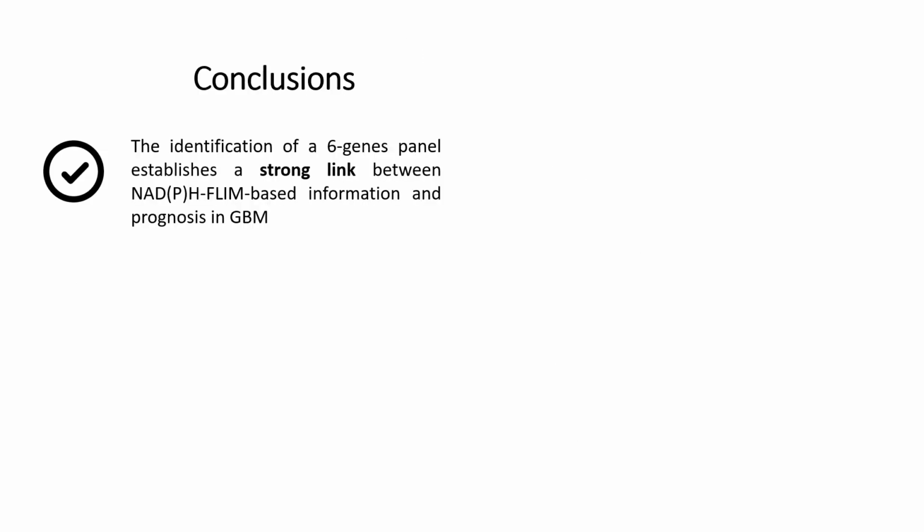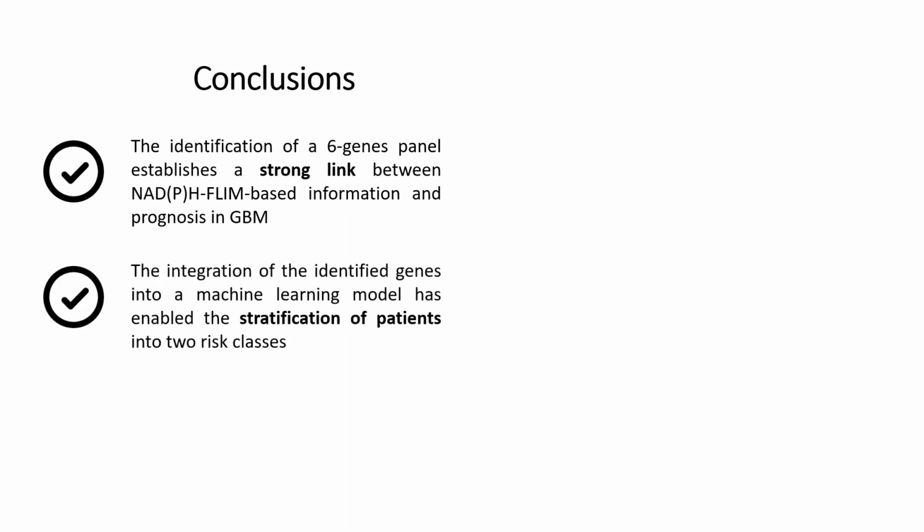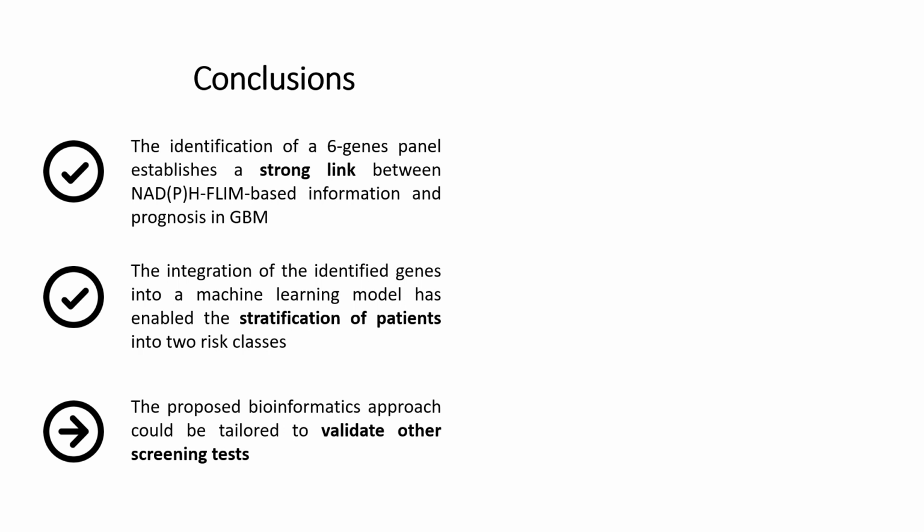So, to summarize, using the FLIM classification, we derived a gene panel with predictive value. This establishes a strong link between the functional assay and clinical outcomes in glioblastoma. The integration of the identified genes into a machine learning model has enabled the stratification of patients into two risk classes, with a performance comparable to a well-established prognostic factor. We highlight that our bioinformatics approach could be tailored to validate other screening tests that cannot be directly investigated with retrospective data.